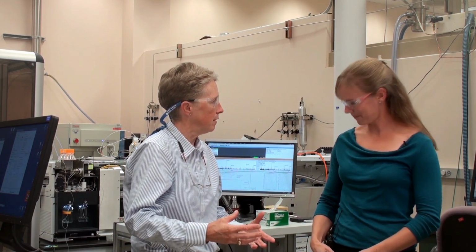and then we can just analyze the peptides with the mass spec. Right, and so the peptides tell us a little bit about the microbial community down there, how nutrients and carbon are flowing. Yep. Ultimately it tells us about the carbon dynamics and the carbon cycle, for instance. So we're getting a lot of information out. So it sounds to me like you're looking for different molecules in a sea of molecules, or you can identify. So what are the other applications?